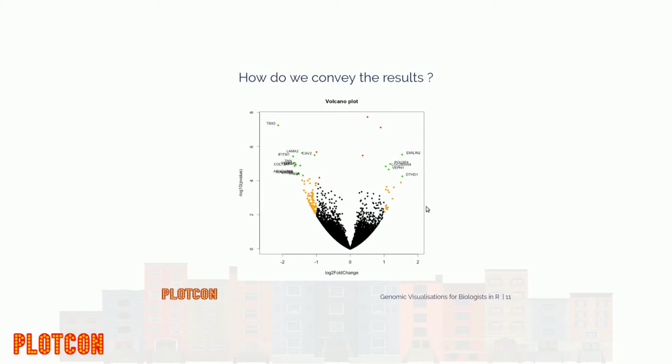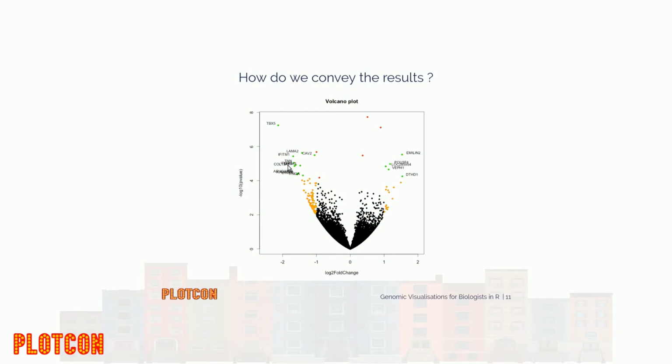Another thing you might do is something called a volcano plot. What you have here on the x-axis is some measure of effect, so an effect size, a regression coefficient. And on the y-axis, again, it's the negative log 10 p-value. So this is more for, okay, I have something significant, but how much of a difference does it make? How much of an effect does it have? That helps you discern this. And what you can see here is, again, it's very cluttered, especially the text. It's hard for anybody to see.